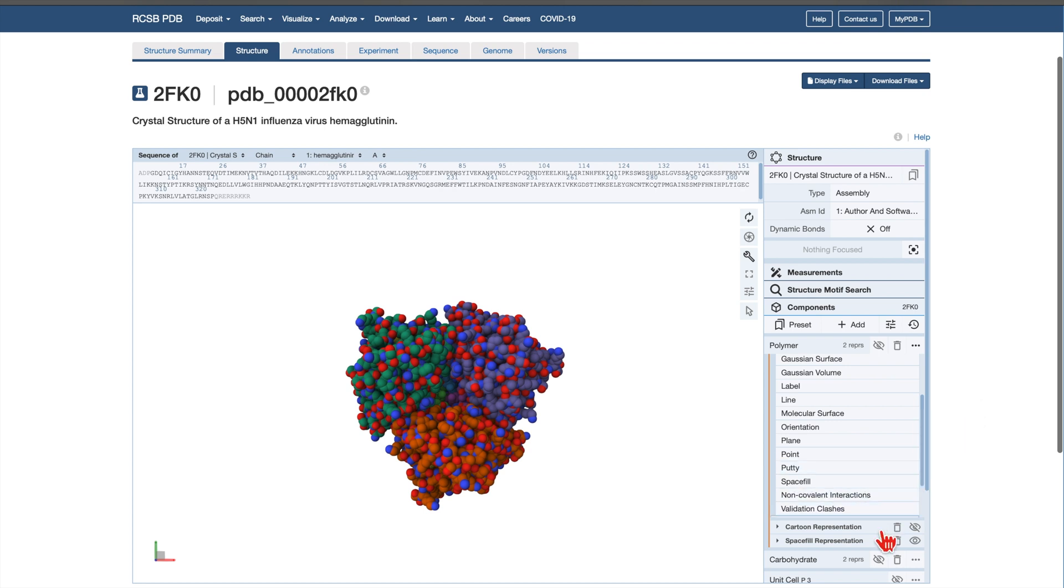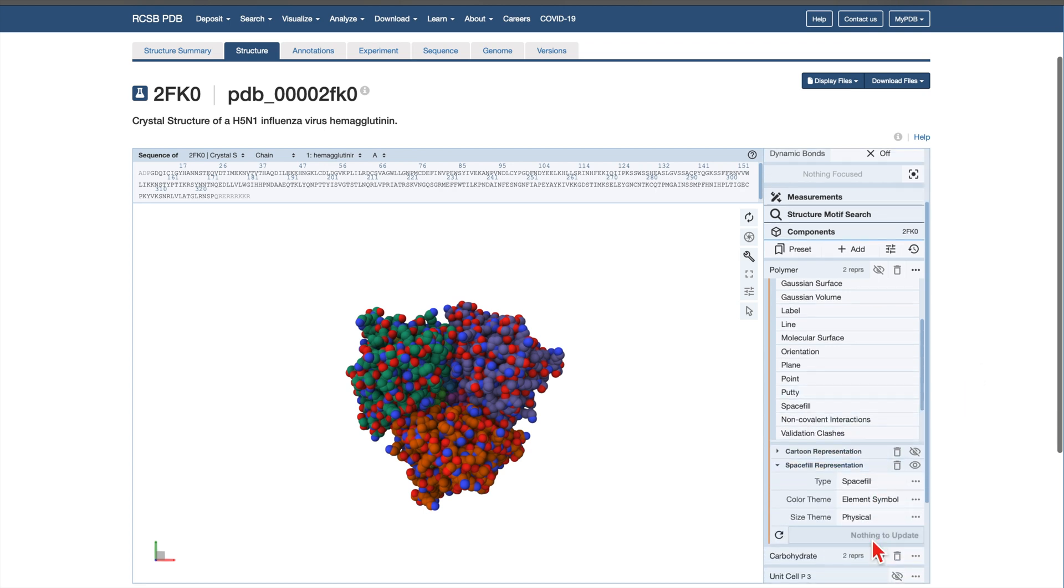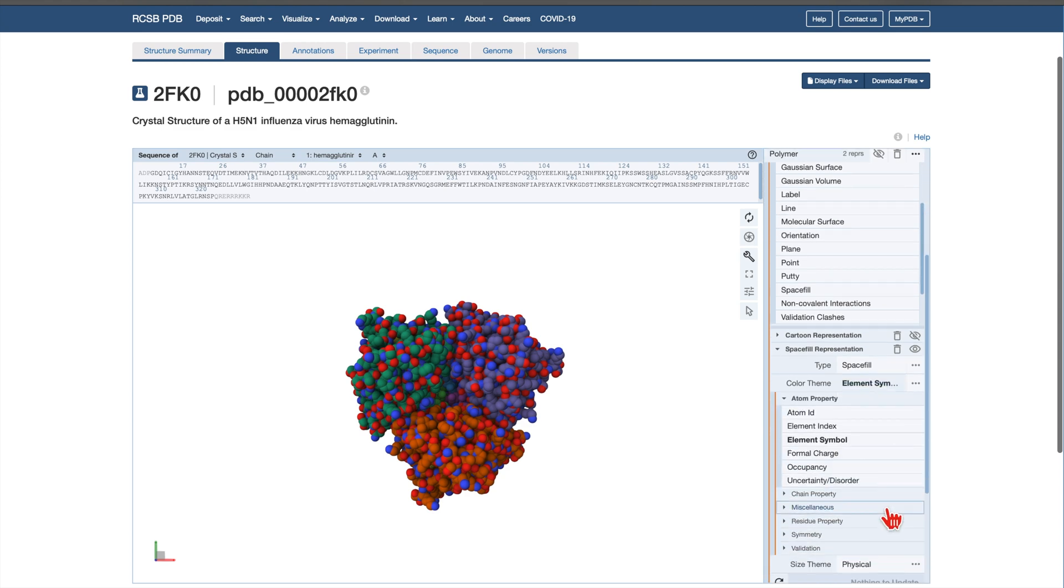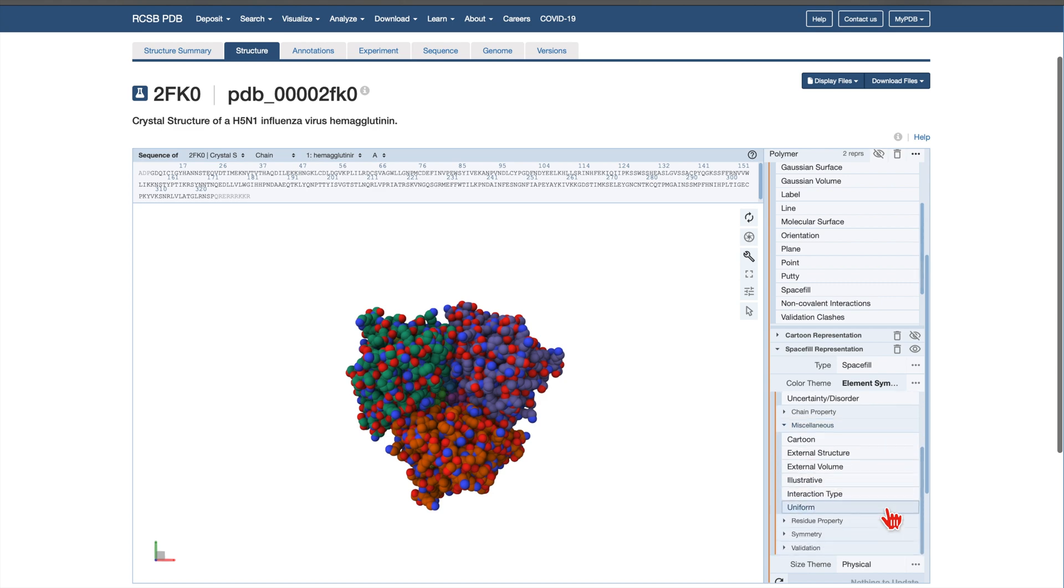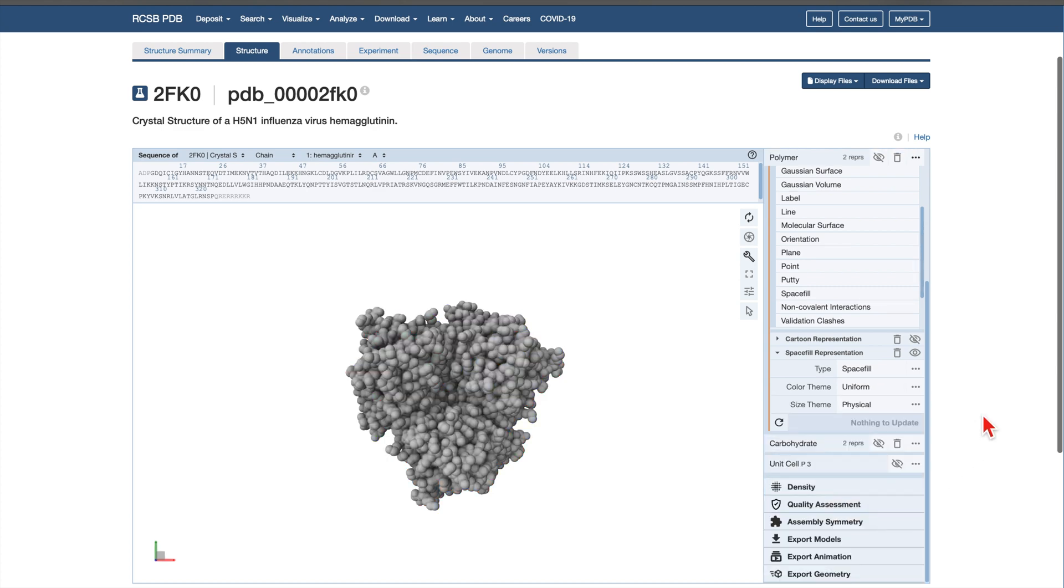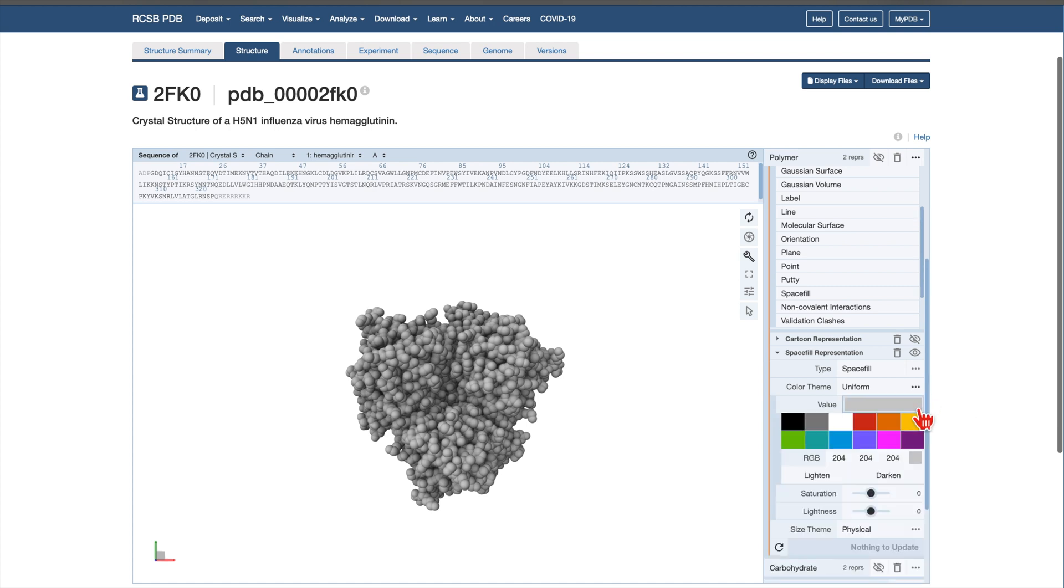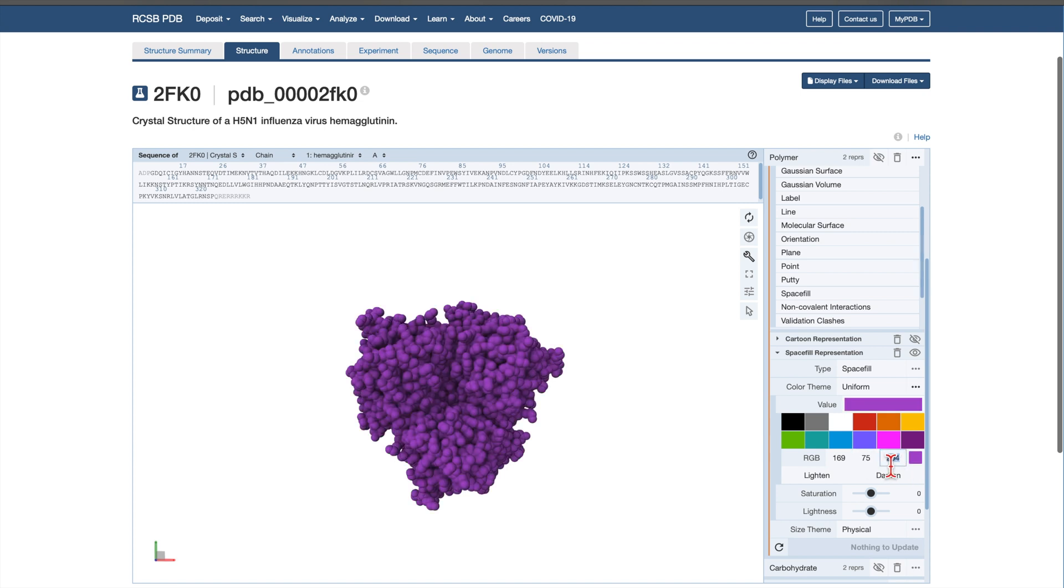Expand the newly created Space Fill representation by clicking its dropdown. Click on Element Symbol next to the Color Theme section. Next, click on Miscellaneous, followed by Uniform. Now, the structure is colored uniformly in gray. Let's now apply a specific color for visual emphasis. Click the three-dot icon on the Color Theme row to open Advanced Options. Click on the gray area next to Value to change the color from gray to an RGB value of 169, 75, and 255. This changes everything to the chosen color.